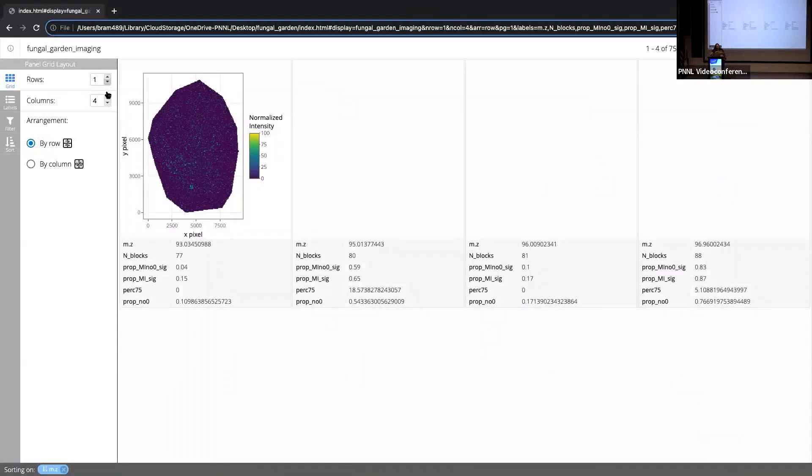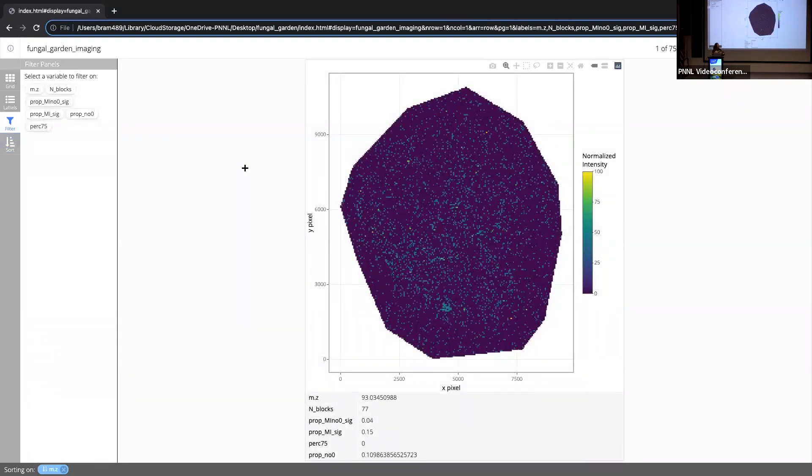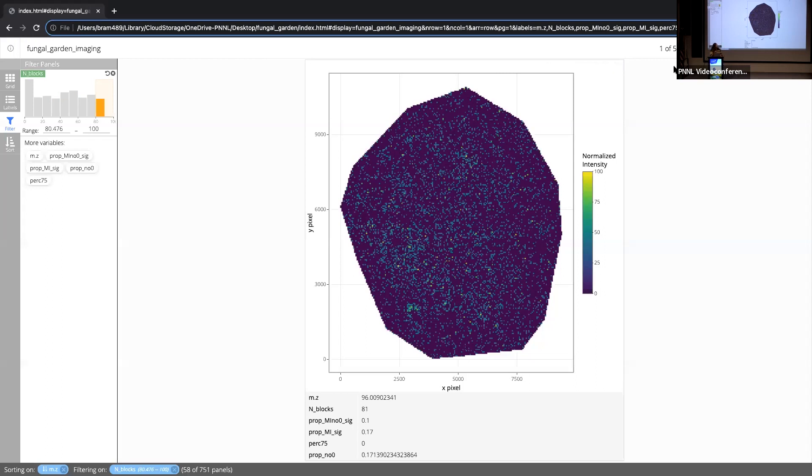So when I'm talking about divide and recombine detailed visualization, this Trelliscope tool will let me go through and visualize every one of these m over zs. There are 751 of them. Hopefully you think to yourself, why would I sit there and do that? One really nice feature is I can put this into a grid and you could start looking at multiple things at once and looking for common trends or patterns or unique trends or patterns across the different m over zs. But still, this is a lot of just manually looking at the data. You can very simply put in some of these metrics that I'm talking about. For example, I divided this, without knowing even what Kristin's data looks like and what the different features were, I naively broke this area up into 100 blocks.